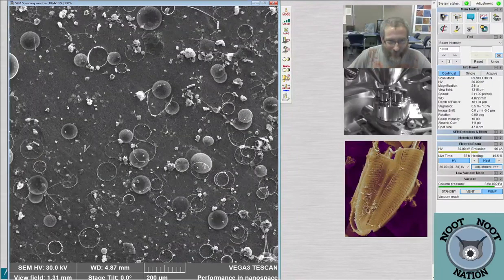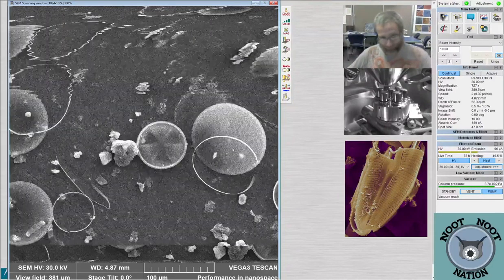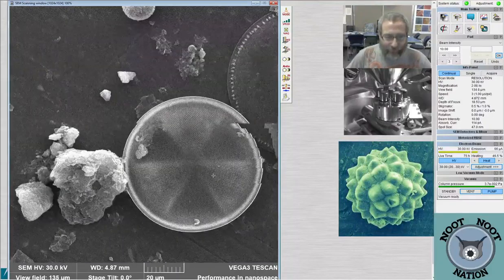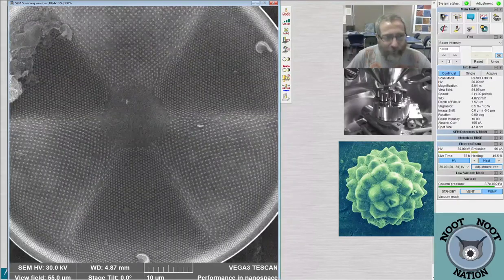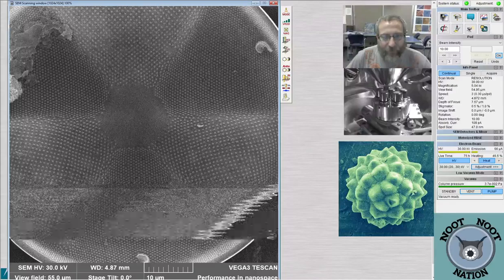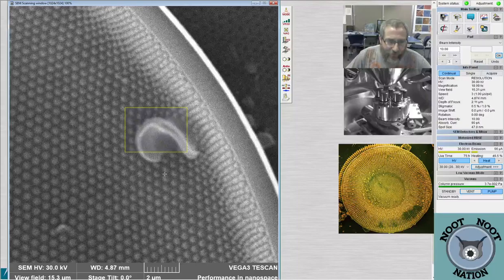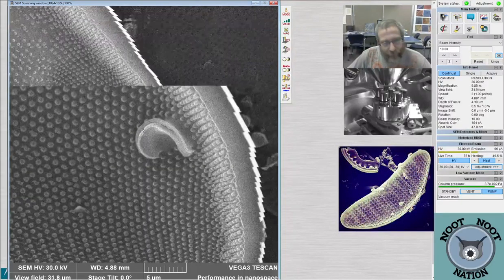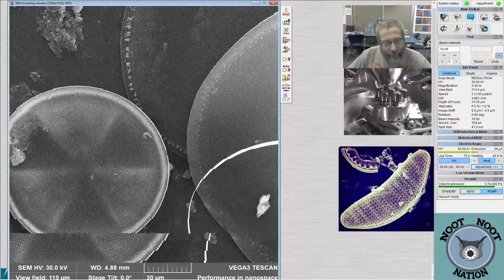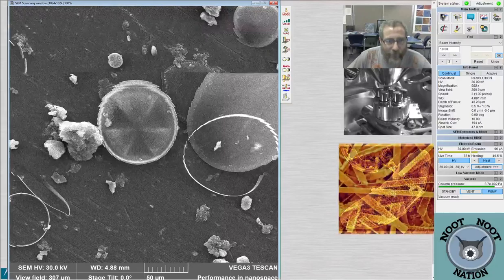Many of these are Thalassiosira, and many of them are actually the same species. But if you were to look at this one, for example, that's Actinoptychus, a nice clean one, except for a little bit of junk up there. And we can actually look at the labiate process for this one. It's pretty clean. It's beautiful at the labiate process. So nice. Yeah, it's a radiation symbol. Actinoptychus. Yep. There's one emote that we use that is this diatom.